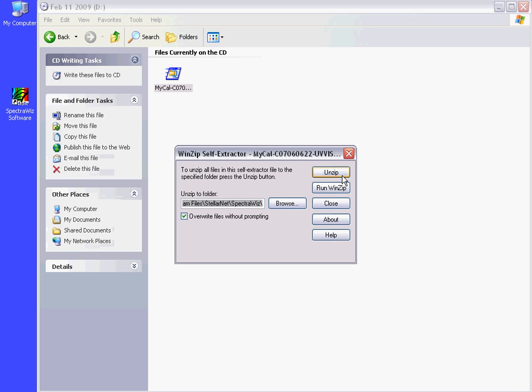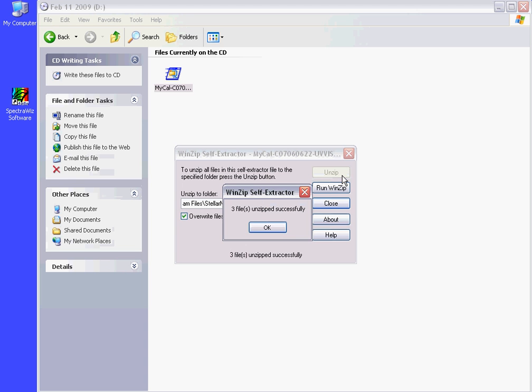You will be prompted to unzip the files to the SpectraWiz software directory. Three files will unzip successfully.